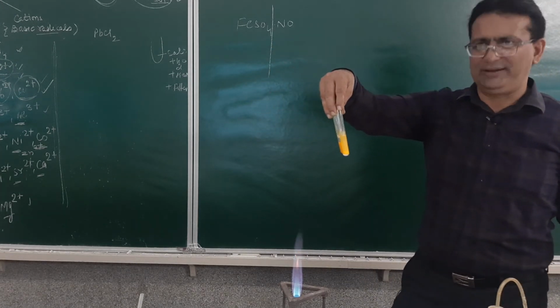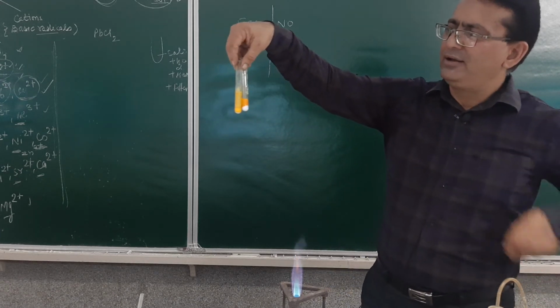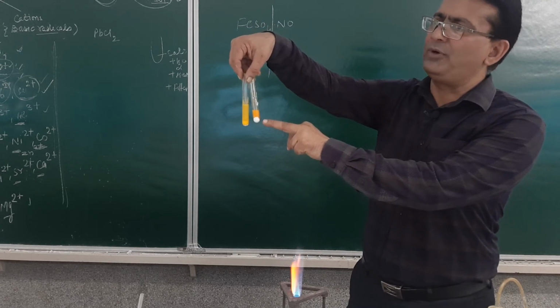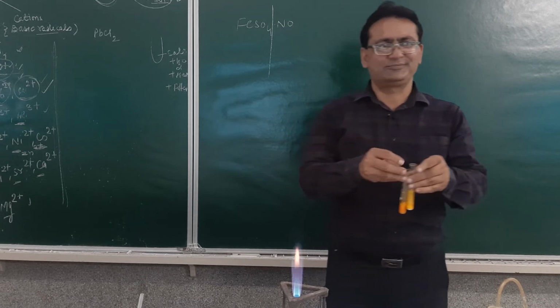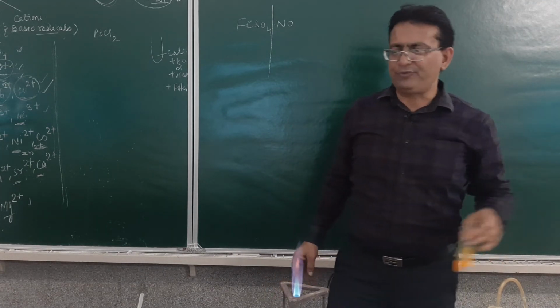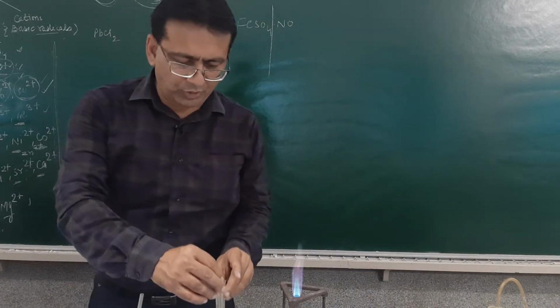Sarso in Hindi it is called. Sarso ka phool. So it is yellow in color. This is a mustard yellow and this is similar to the uniform of a policeman, a khaki color. You may see this. So this will be two distinctions. This confirms the presence of a lead ion. Is it clear, students?